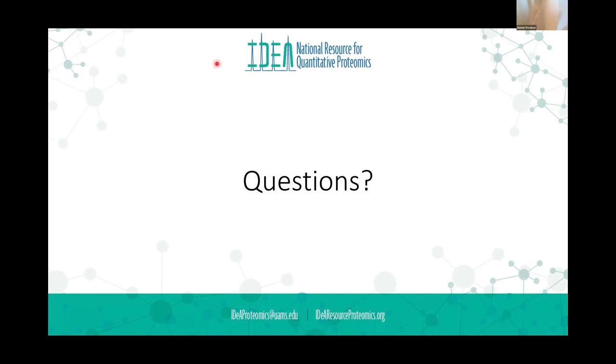For a lysate, that's not true. If you send us a milligram instead of 100 micrograms, Lisa in the lab is probably just going to talk badly about you because you sent too much. It's not going to help. But for phospho, it will probably help. The more, the better, really, for phospho. So I would say, within reason, the more, the better.